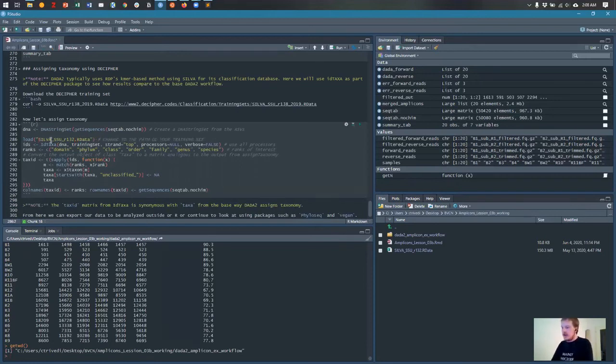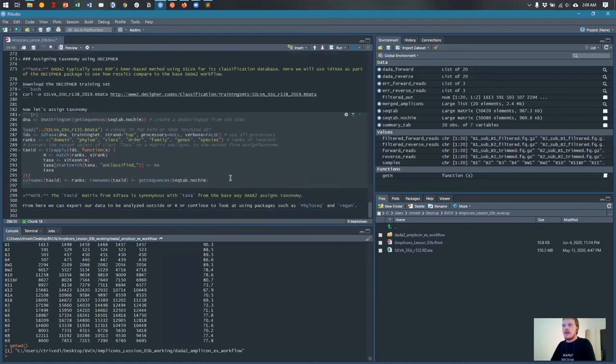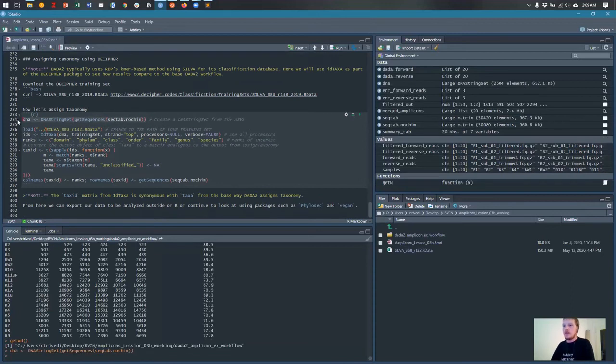And I think I can designate the 2 dots for it to go up. All right. Let's make sure I do this correctly. So I'm going to run through one by one.